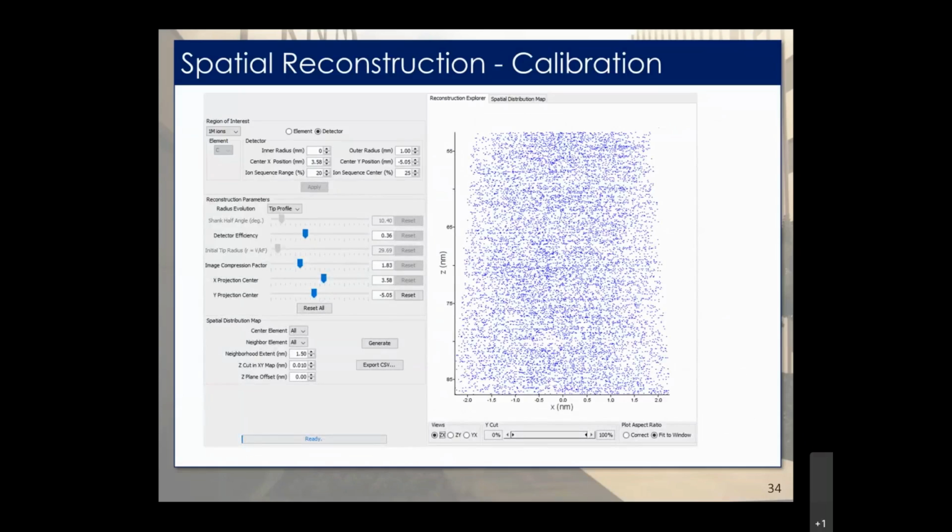What we want to do in this case is look directly at the material at those poles, because that's where we'll be able to build the spatial resolution highest for that plane spacing. So we define a small region on the detector. Here we're taking only a 1 millimeter radius, in detector space, and placing that at the detector XY coordinates where we see that pole.